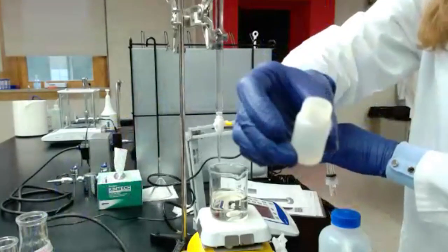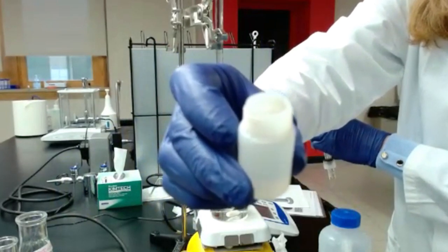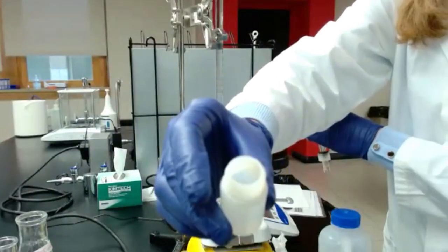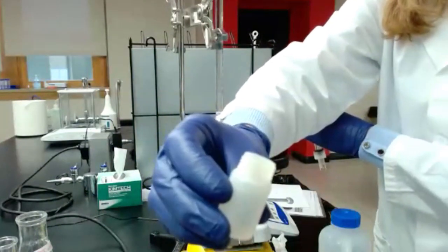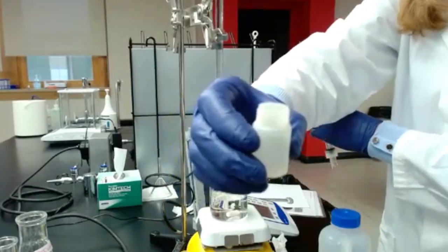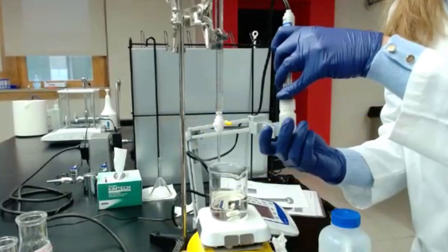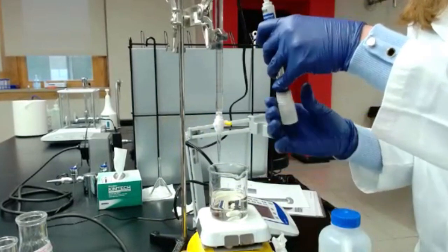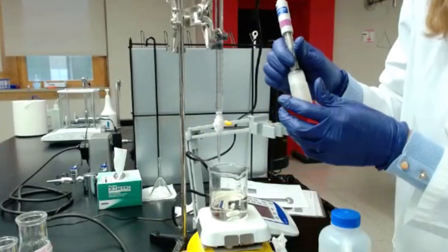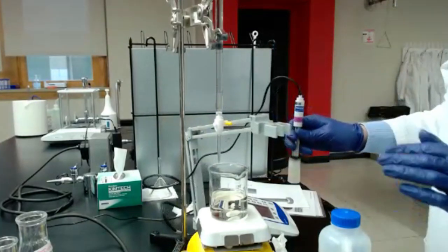And you can put the storage solution back. Make sure your container is full of storage solution and it's not moldy. Sometimes you might see black spots. That means it's moldy, and that means it's not good anymore. So you will need to empty it, clean it, and then refill. And make sure the entire probe is in contact with the solution, because you don't want to let it dry. If your probe gets dry, it won't work very well anymore.